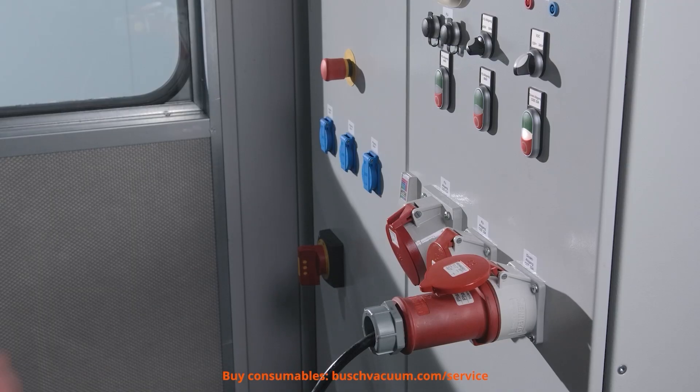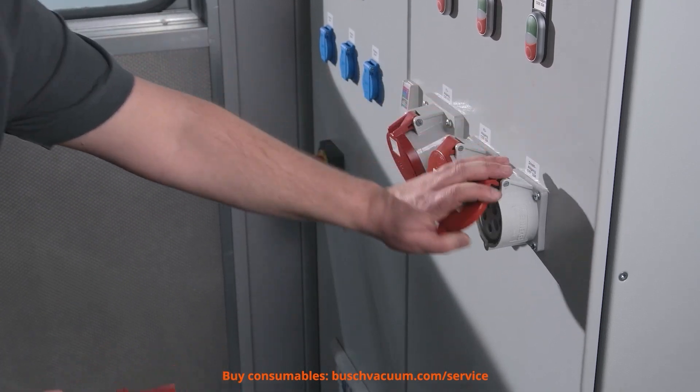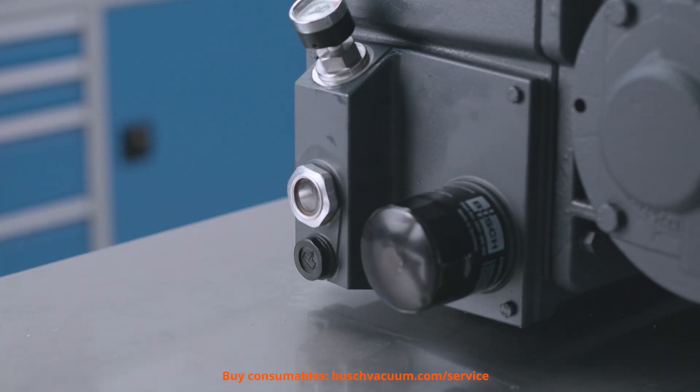Before we begin, we ensure a safe working environment and check if the vacuum pump is shut off. It is recommended to change oil on a warm pump that was running before shut off.